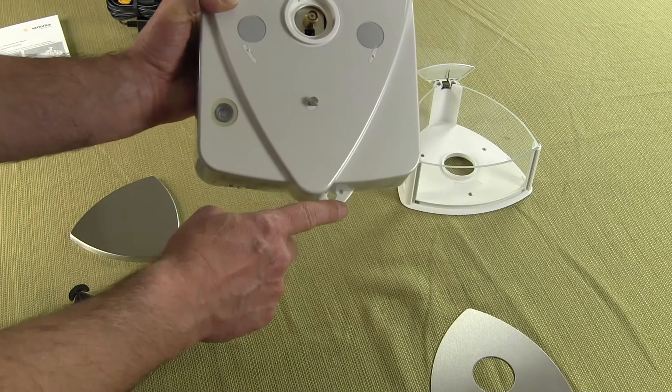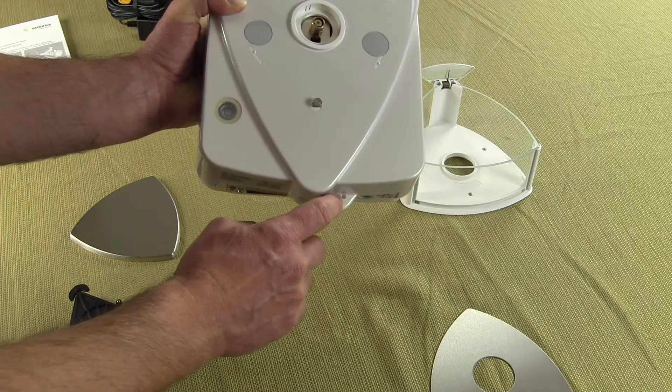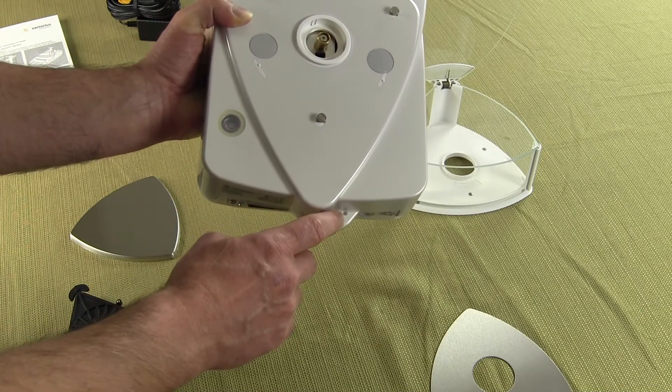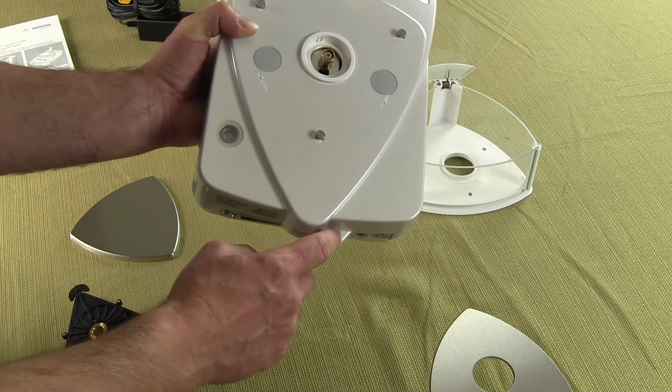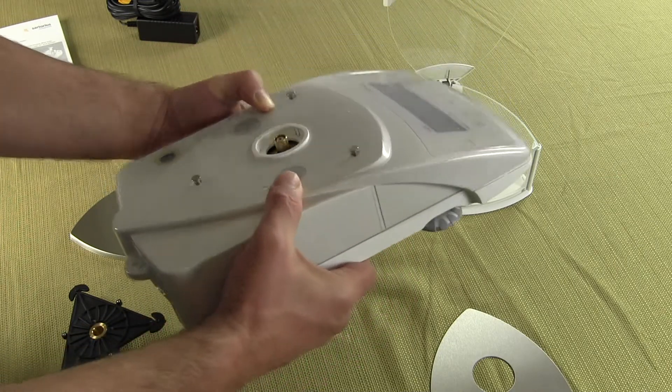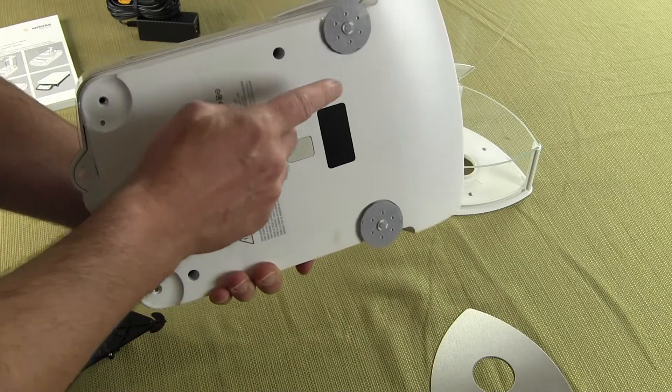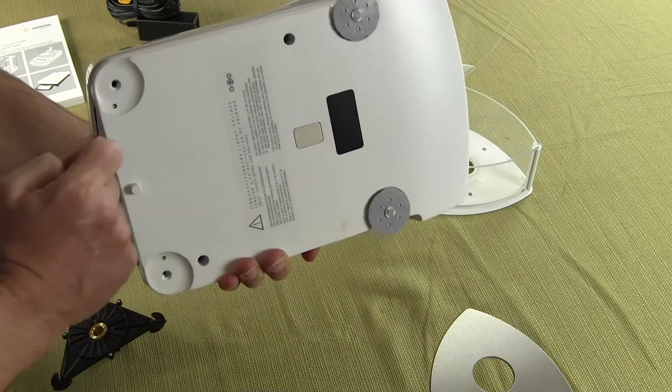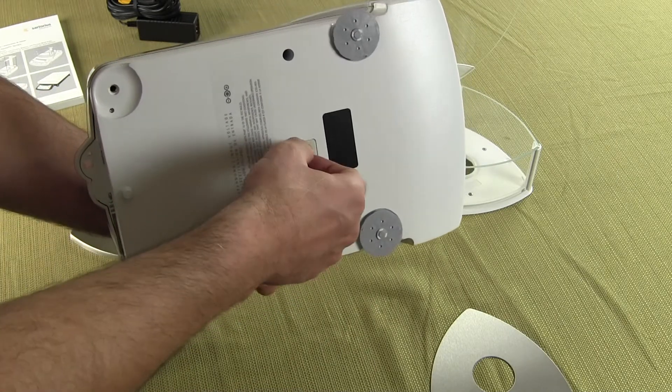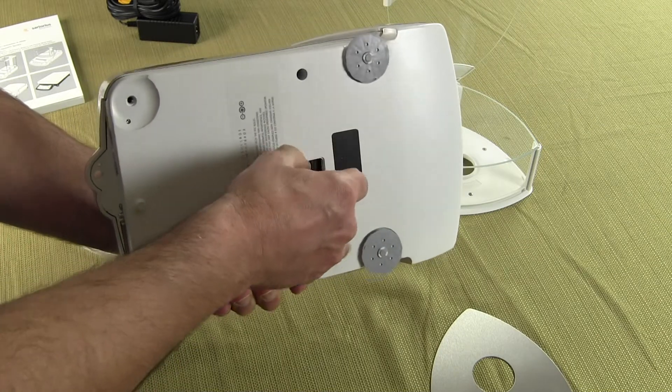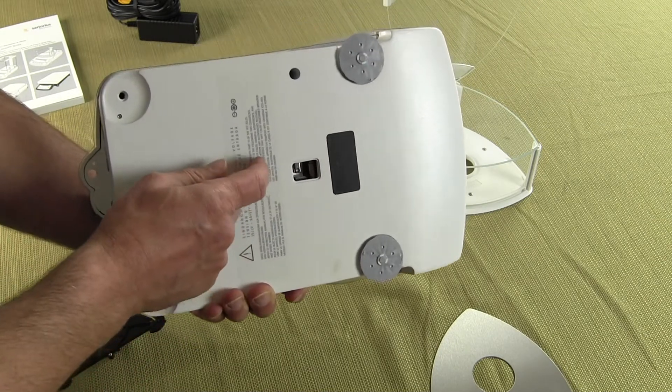On the back here, this i-loop, this would be for putting a cable through the balance if you wanted to lock it down on your bench. On the bottom of the balance we have two adjustable feet and this port right here in the center, this is for an underhook.